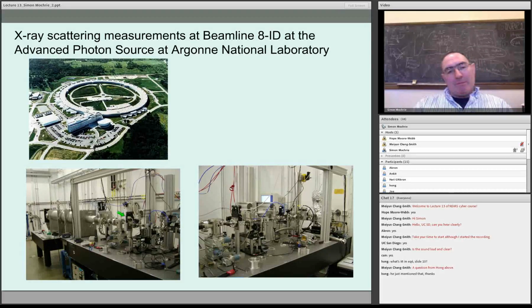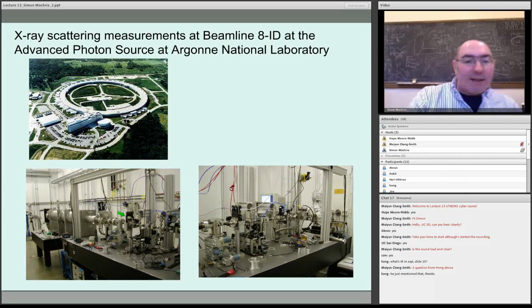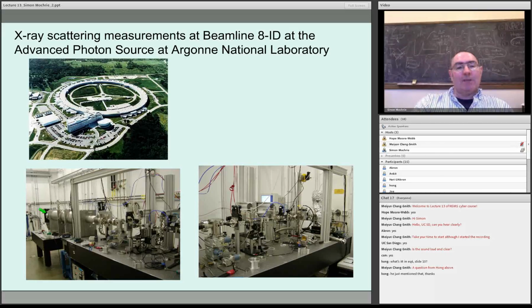That aperture the beam down to a few microns. So there's this sort of nice change in scales all the time. Anyway, the sample is in this can here, and this few micron-sized beam hits the sample and then is scattered and goes down this flight path tube here that's expanding to accept the ever-widening scattered beam. And then at the end here, where I'm pointing to now, is where the X-ray area detector is. So this is sort of what things look like.